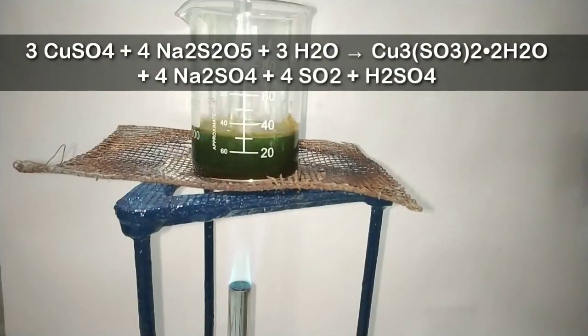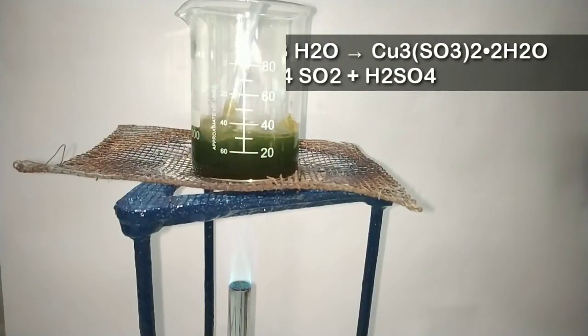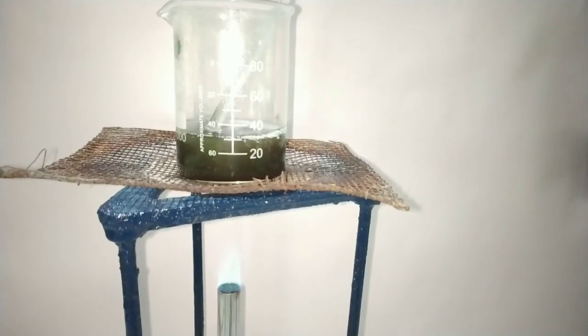The exact mechanism is unknown, but it is said to occur in multiple steps. The sodium metabisulfite is first decomposed by heat to form sodium sulfite and sulfur dioxide.